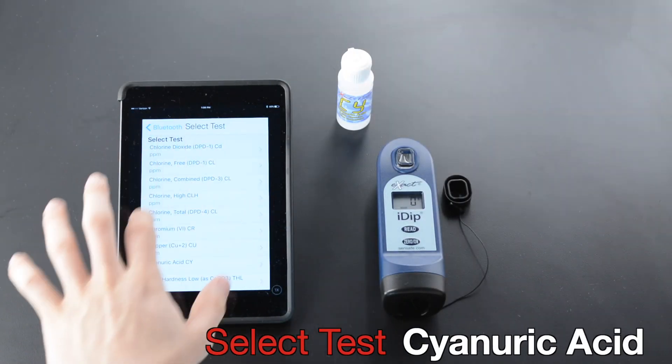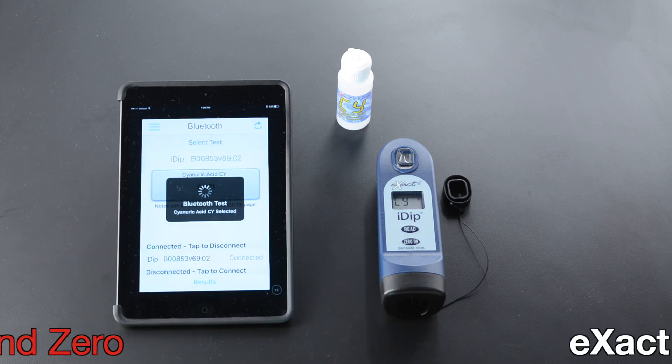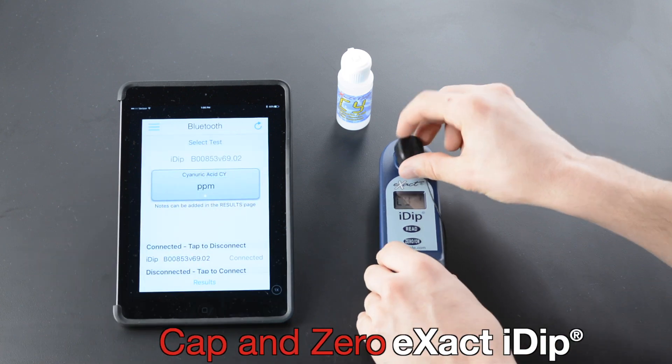Select Test. Cap and zero the Xact iDip.